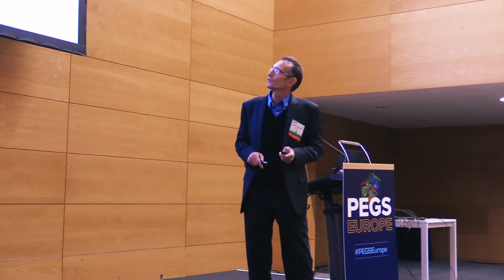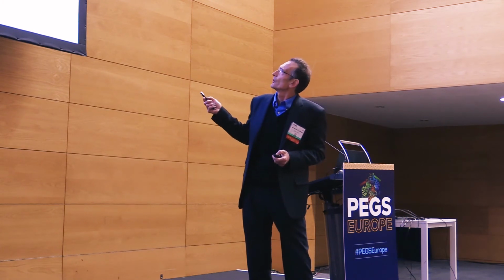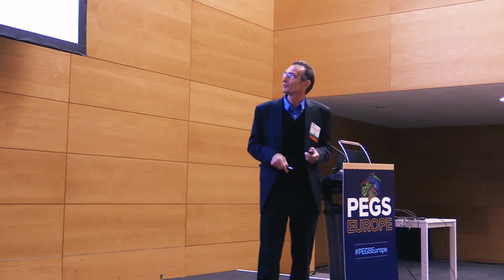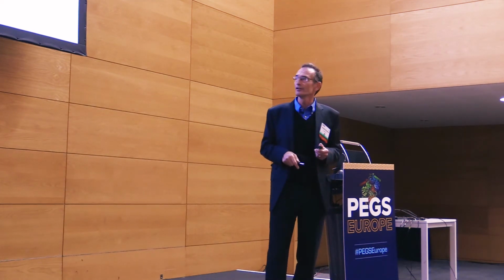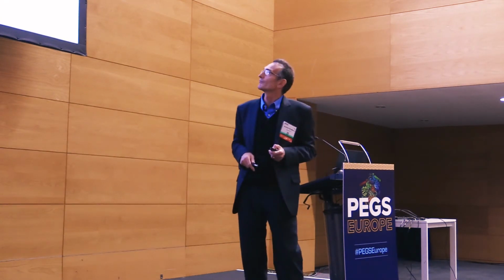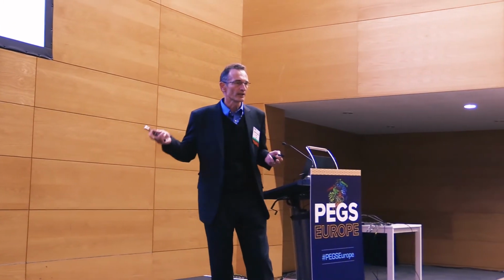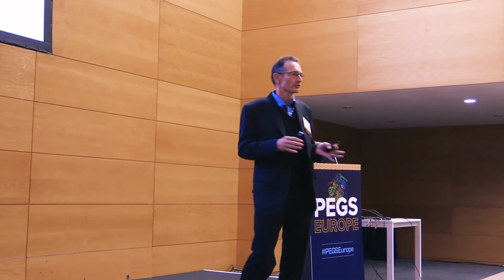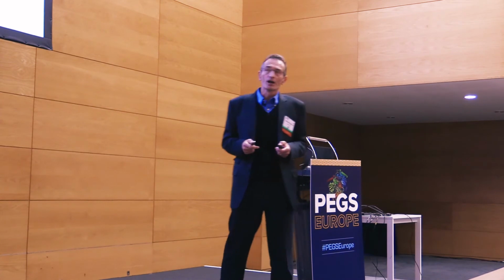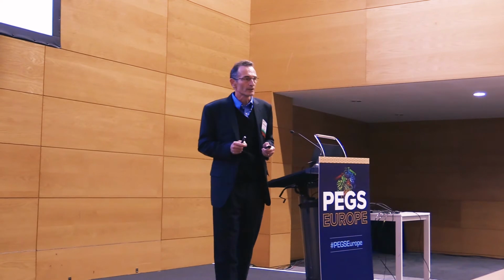The same is essentially true with the light chain, except that we use natural replicated diversity also for the light chain CDR3. Eliminate the CDRs with liabilities again, synthesize the oligos, and assemble them into the scaffold. So what sort of liabilities are we eliminating? So these are just a few examples. We actually have a large list. We scour the literature to look for different liabilities. So this is deamidation, isomerization, glycosylation, and unpaired cysteines.